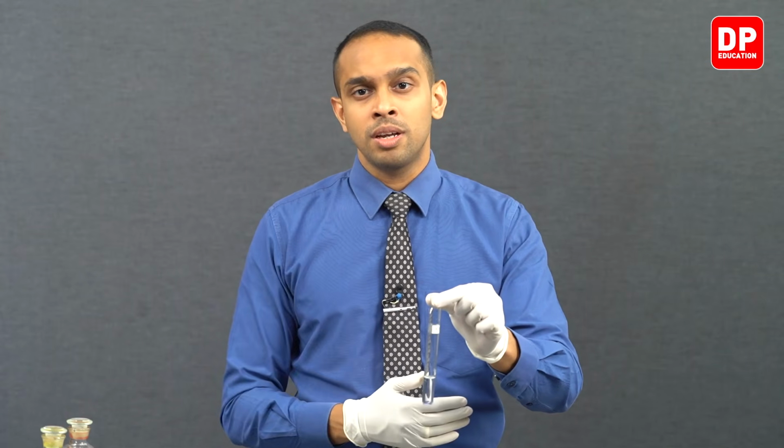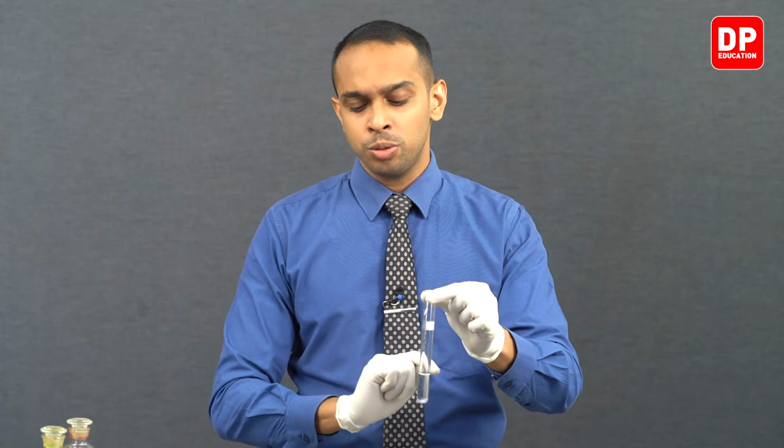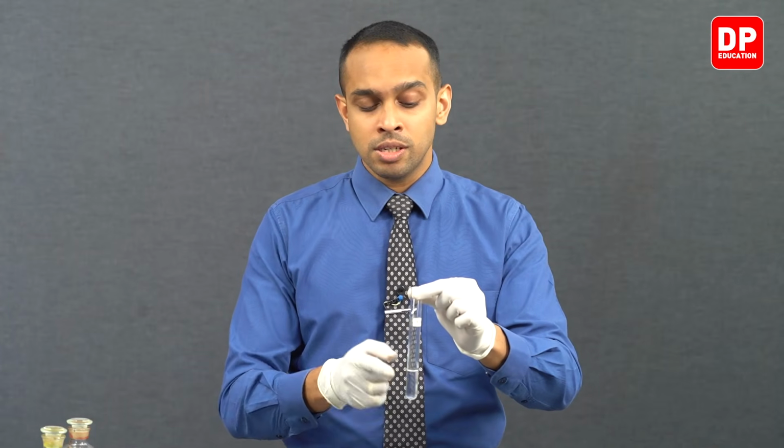If you want to convert it into lead sulfide, you can heat it up, and as you heat this precipitate, you will see the white color lead thiosulfate turns into lead sulfide, which is a black color precipitate. However, as soon as you add lead acetate into our thiosulfate ion solution, the white color precipitate that is formed will not turn into a black color precipitate readily.